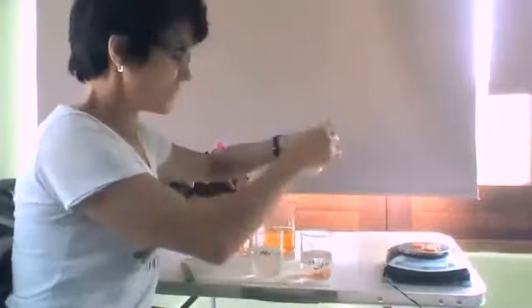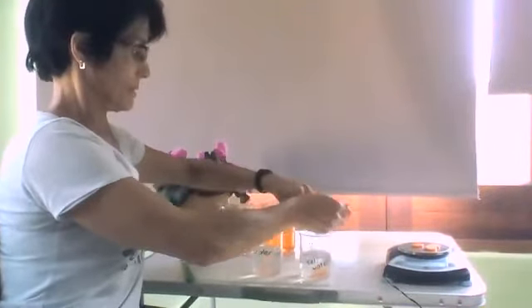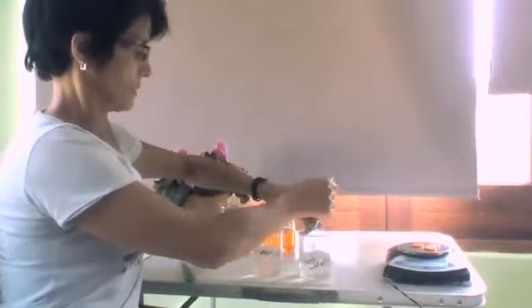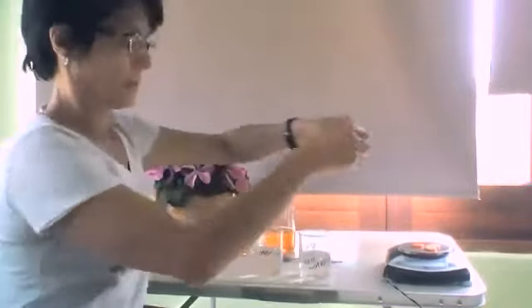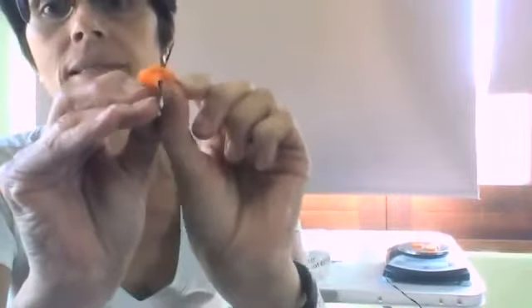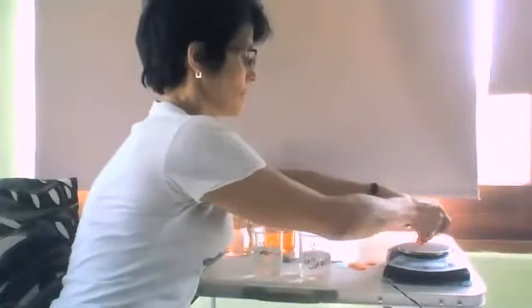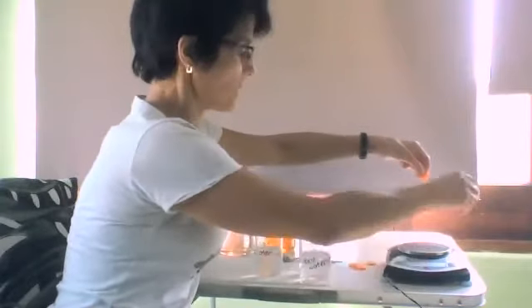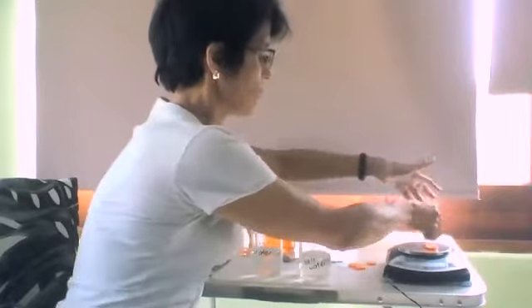And the one that we placed in salt solution — now watch. It's very bendable. It's soft. And I weigh them. They are 5.95 grams.